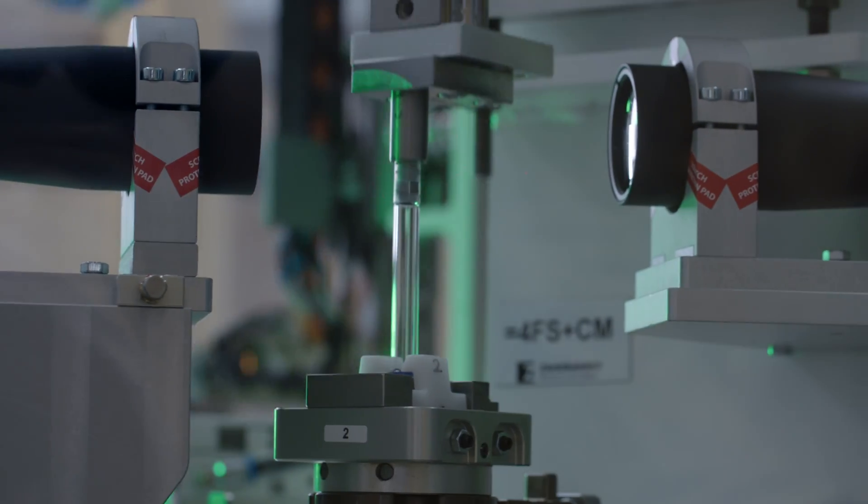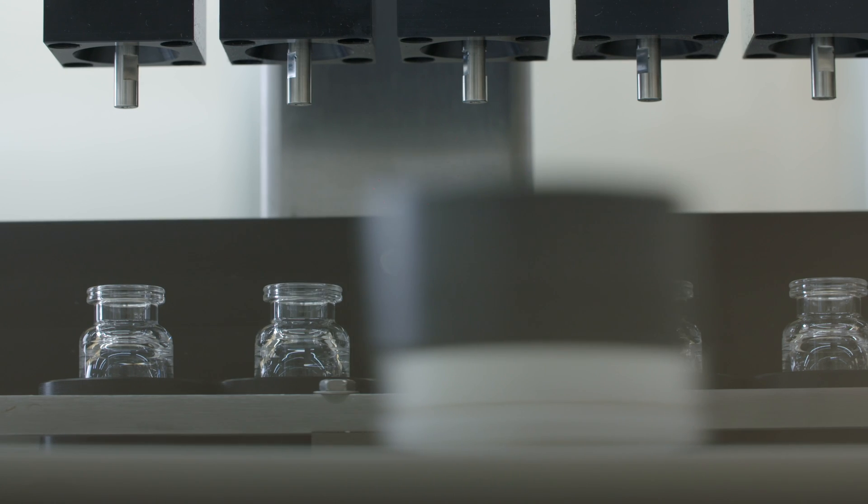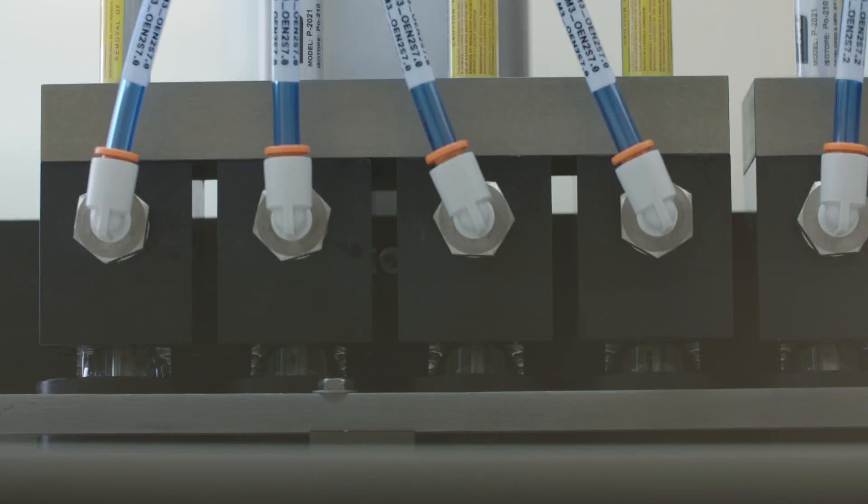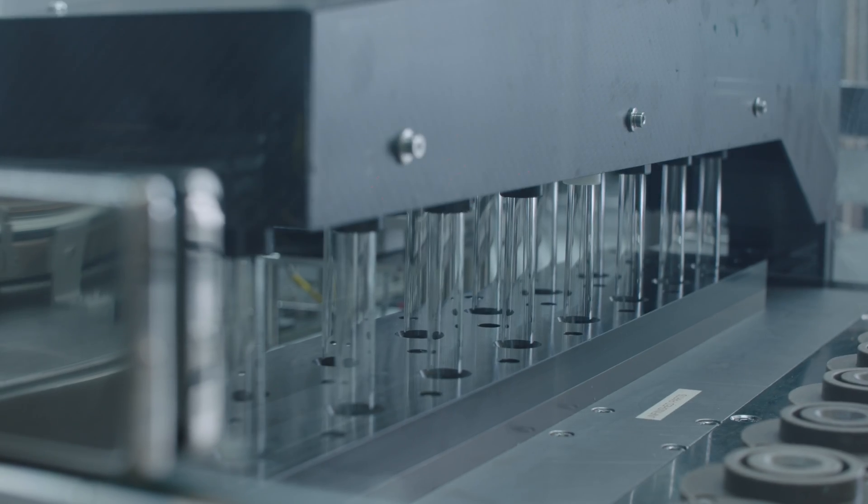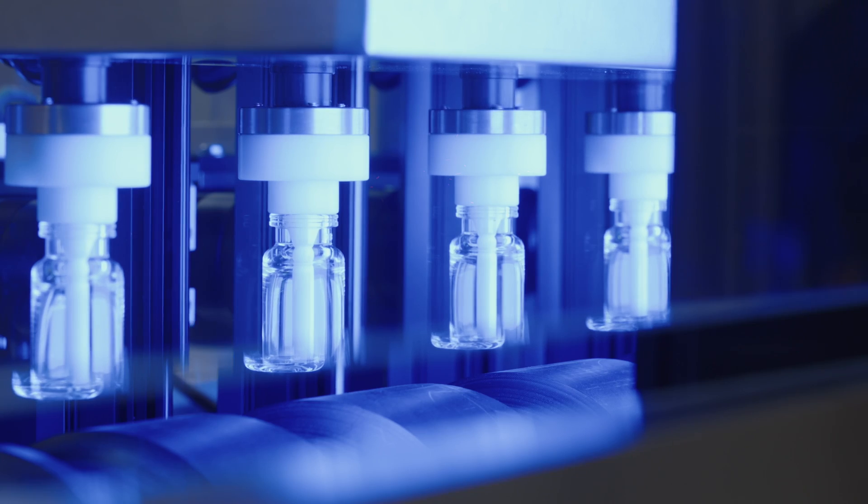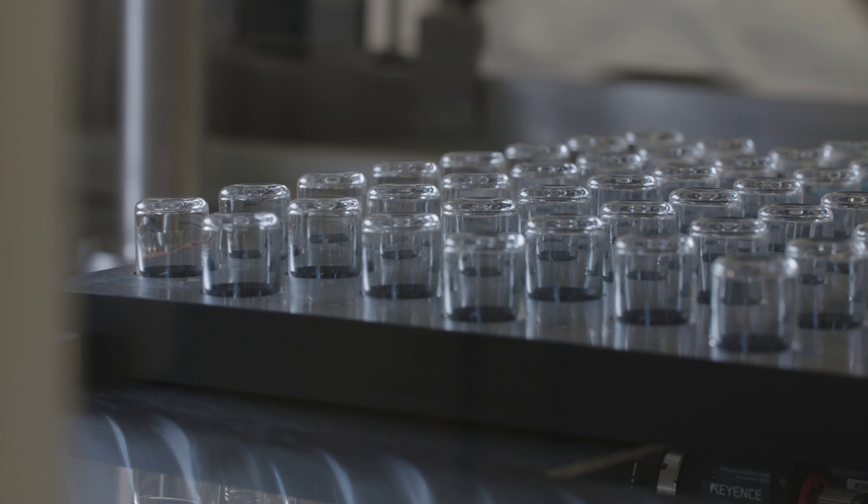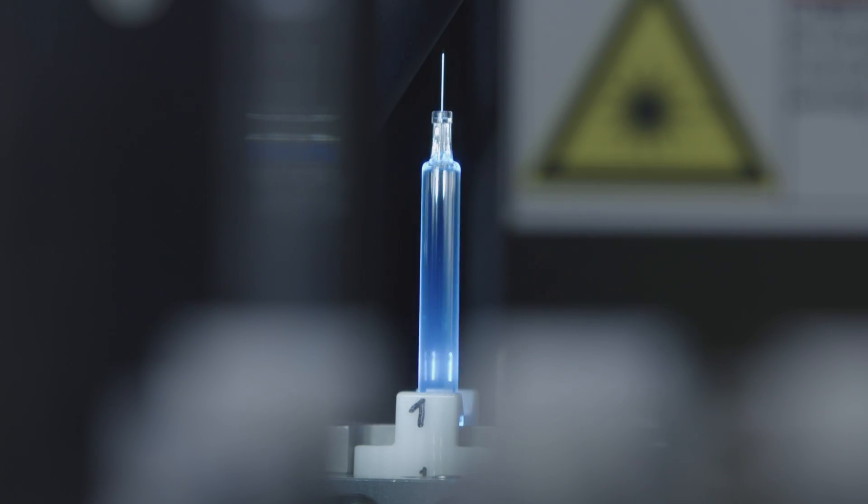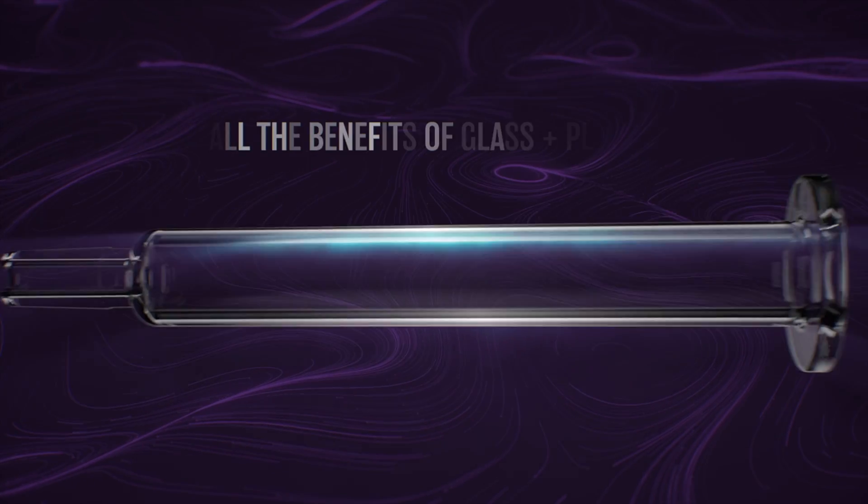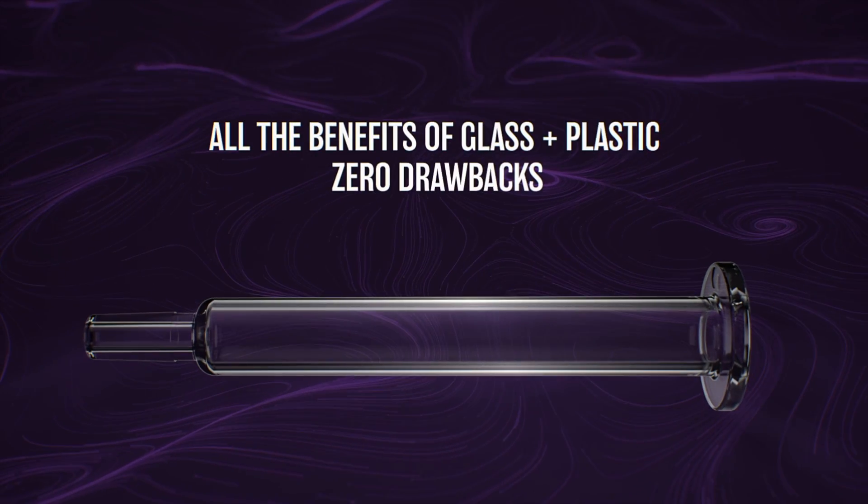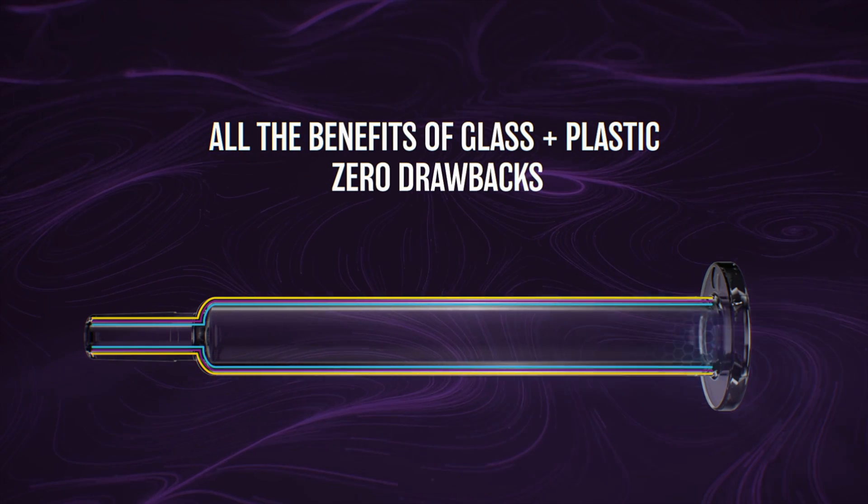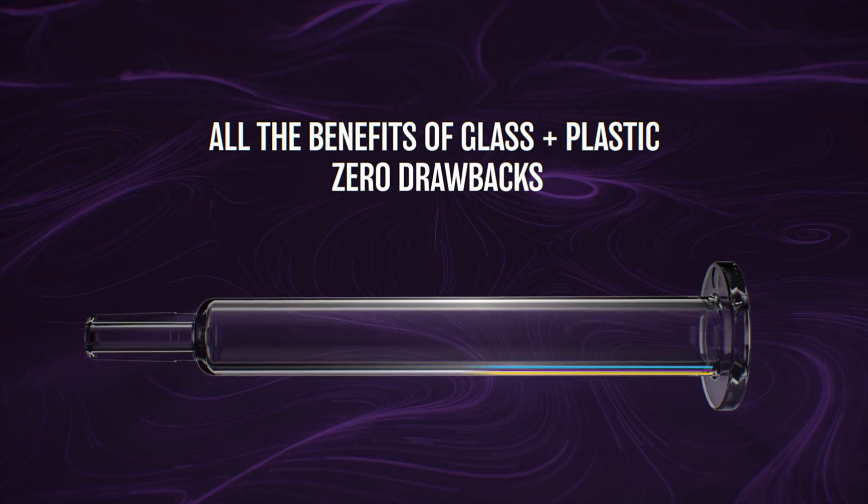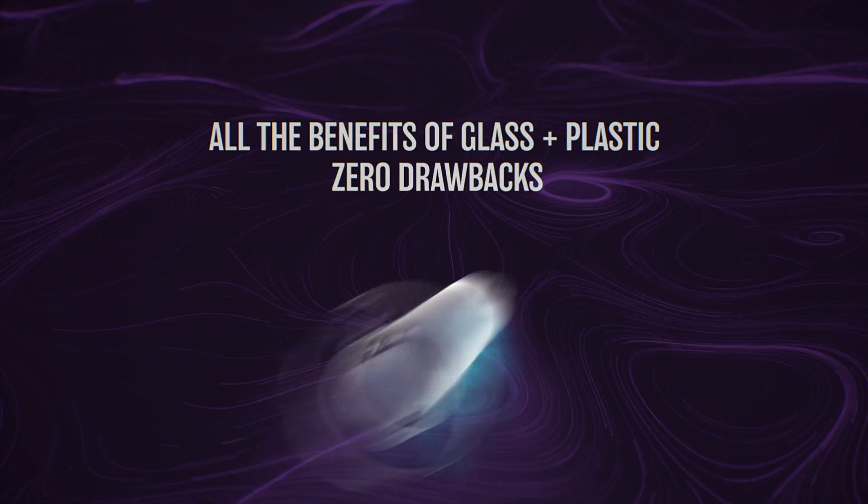SIO2 focuses on designing and manufacturing vials, syringes, tubes, and bottles of any size and format using a new hybrid material. This hybrid material fuses all the benefits of glass with all the benefits of plastic while eliminating the drawbacks of both.